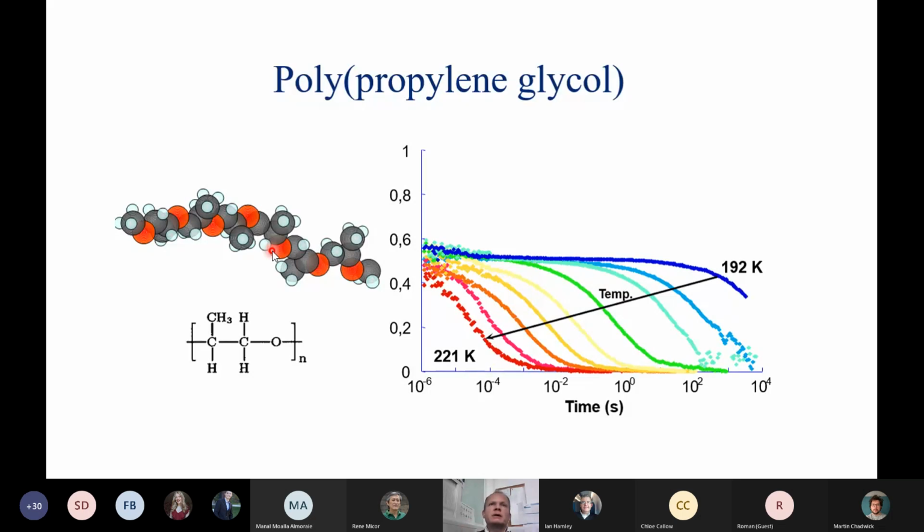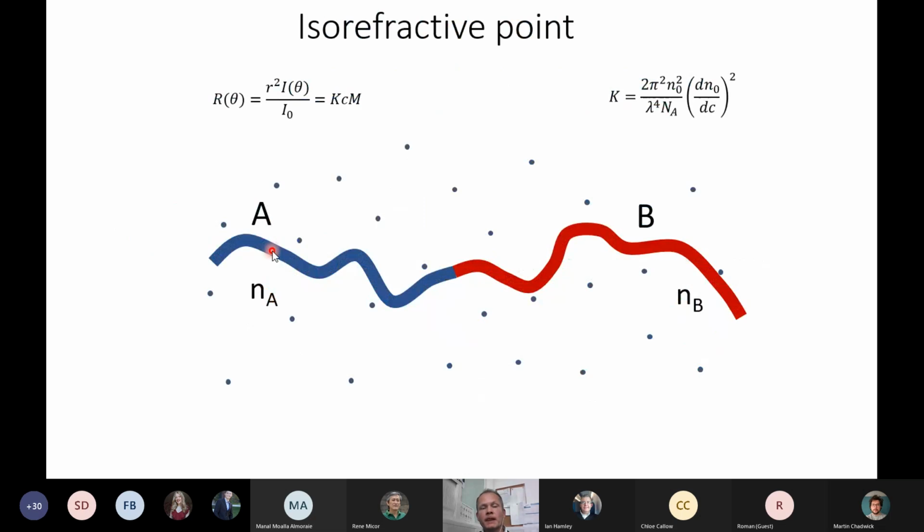But I guess if you are working with a solution of proteins, you shouldn't be concerned about this very much. Again, there are no particles here, but we do see some kind of changes of the correlation function with time. And if we calculate the distribution, you will see some peaks, but these peaks are not real. They just show that we have some kind of thermal motion in this bulk material.